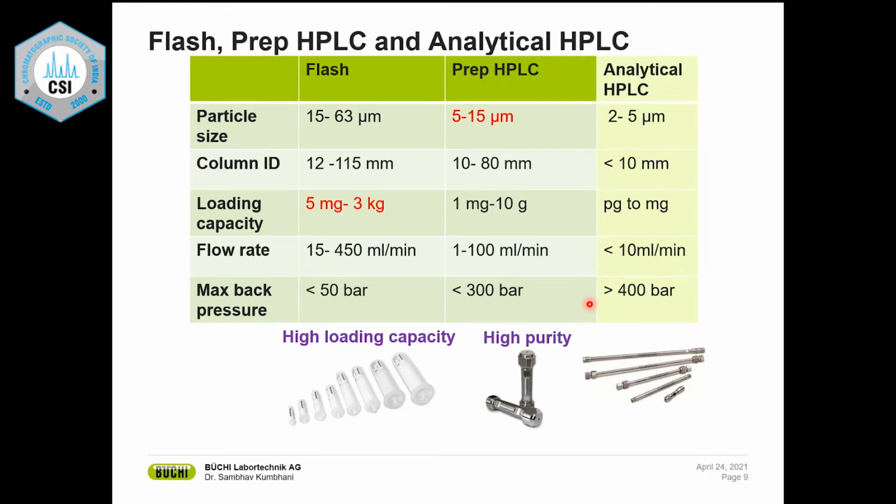So think of it this way: take a big tube or a column, fill it up with huge rocks, and then pour water from the top. The water would just slide right down with no resistance, and come smoothly down without any problem. Now take the same diameter column and fill it up with small, tiny pebbles, and pack it tightly. Now try to pour the water from the top. You will see the water takes a lot longer to come down, and it comes really slowly, because there is a resistance offered by those tightly packed pebbles.